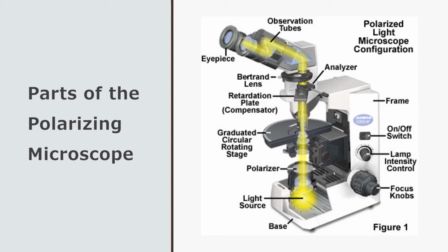Things like crystals will reflect light in very specific ways. Anything that has a crystallized nature to it, a lot of metals and minerals. And you can exploit the fact that it's going to reflect in specific wavelength directions by using this. If it's reflecting in this direction and your polarizer is going to allow that to go through, then you can confirm that that mineral is present.